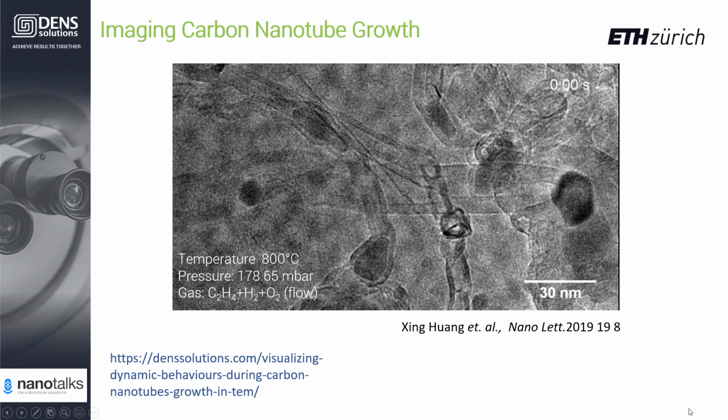This oscillating growth behavior and the structural dynamics strongly indicate that the carbon concentration on the growing side is also highly fluctuating during the course of carbon nanotube growth. And in this growing process, we also see some particles active and some deactivated.